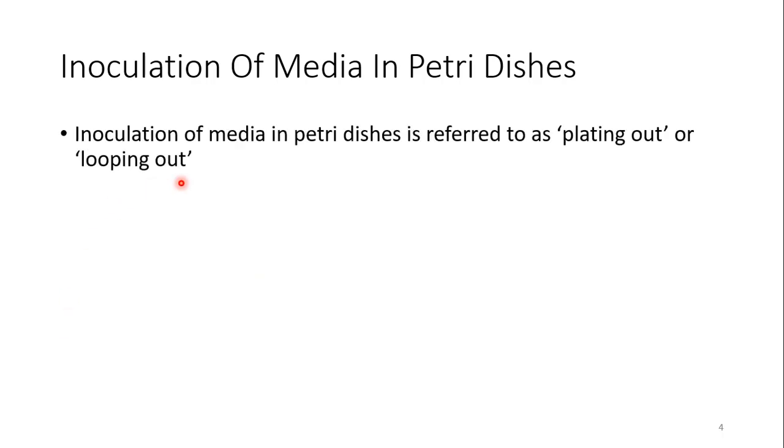The inoculation of media in a petri dish is called plating out, looping out or streaking out. These are the terms which are used for the inoculation of the media.